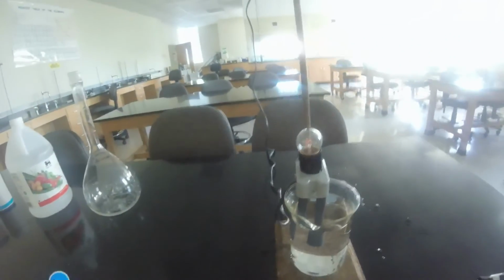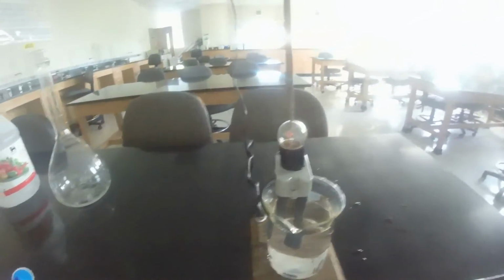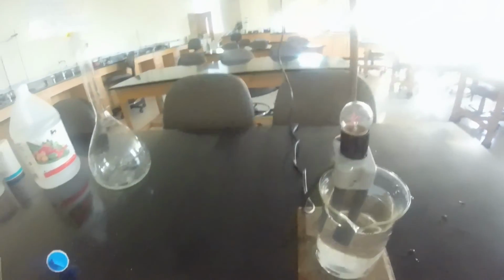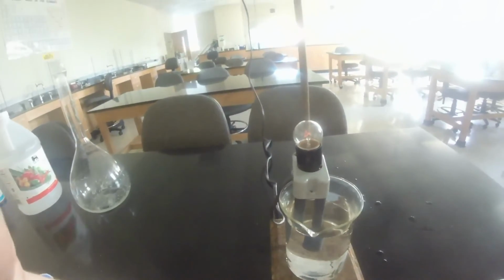Okay. So this is your first demonstration in terms of Chapter 4 and learning about aqueous solutions, being able to classify them as weak electrolytes, strong electrolytes, or non-electrolytes.